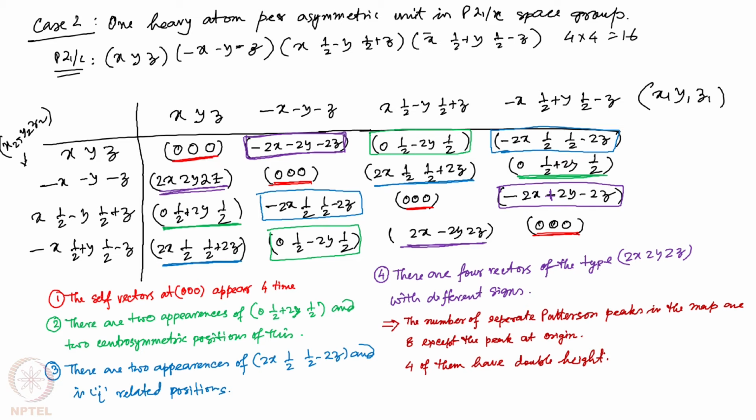So what we see is that we have some peaks of the type u half w, which are here. U half w is located at that point. Similarly, here we have u half w set of peaks. This one is also u half w type of peaks, and this one u half w set of peaks.